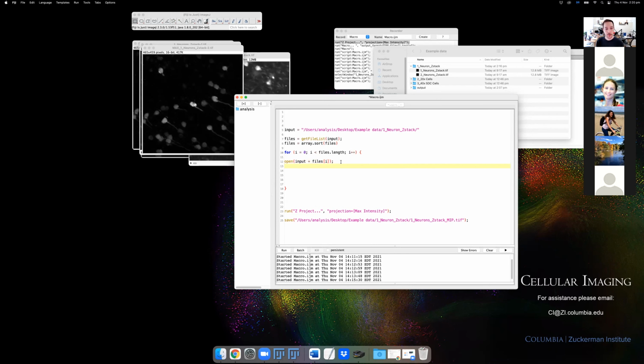And so when you're doing these kinds of scripts, it's very useful to put a little bit of commenting in so people know what's happening, in case you come back to this in 6 months and it's very hard to figure out what you were even trying to do. So you can use just 2 forward slashes, and then you can put in a comment here. This is something that won't get treated as a command. It'll just be for you to read.